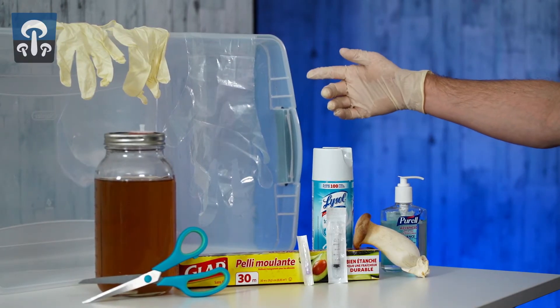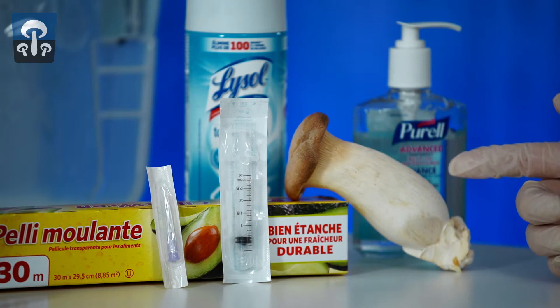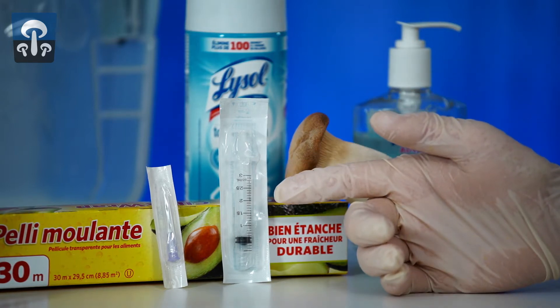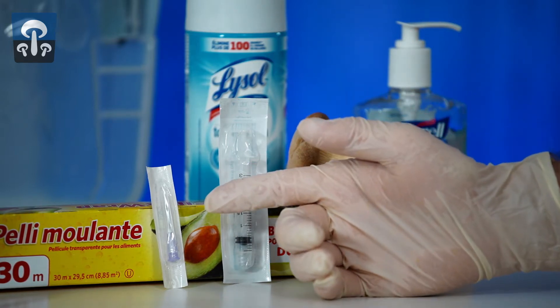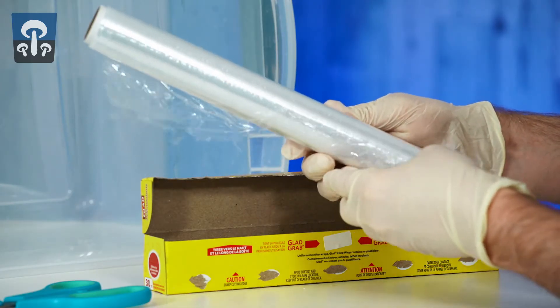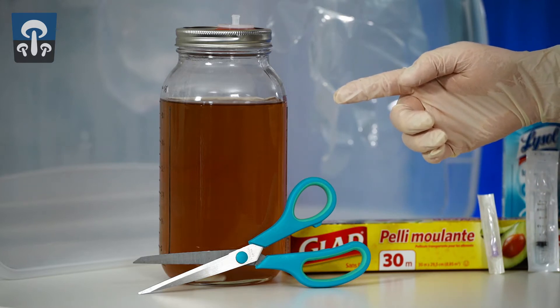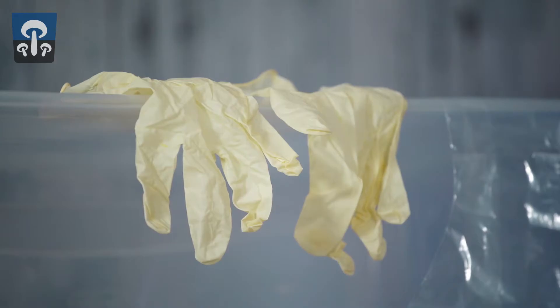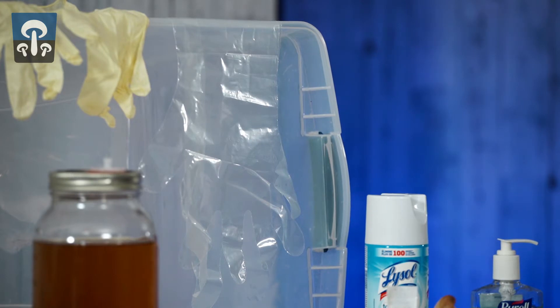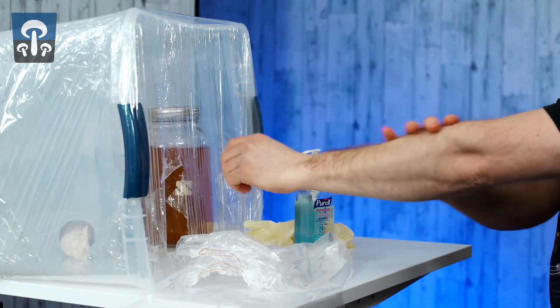You'll need a large clear tote bin, Lysol, a fresh mushroom to clone, a small luer lock syringe, a 16 gauge luer lock tip, cling wrap, scissors, a blank culture jar that we sell, and gloves — long shoulder-length gloves and nitrile or latex gloves. If you don't have the long gloves, you can coat your arms in Purell.